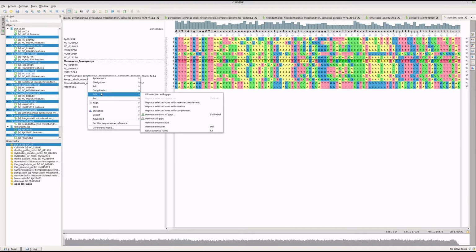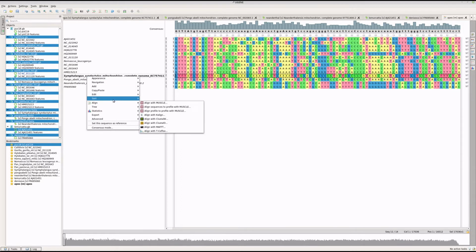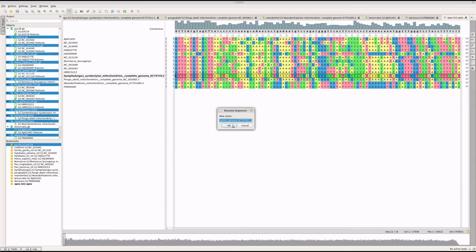I'm just going to rename some of these now, just to show you that it can be done. Because a lot of times people just do what is minimally asked of them, and don't necessarily go on to make it readable. And sometimes making things readable and presentable also makes things more professional in nature, right? So here we go.